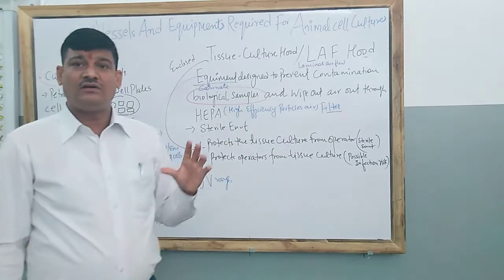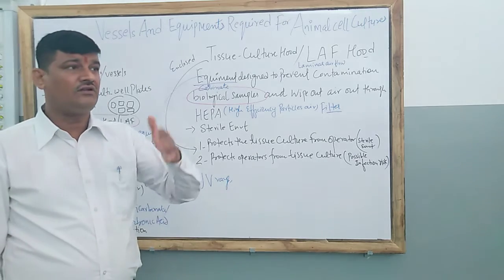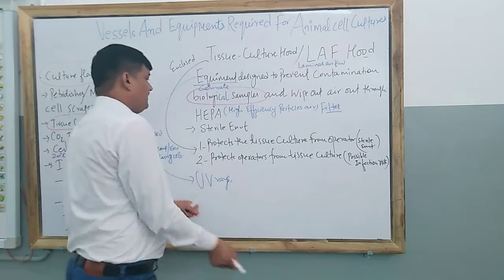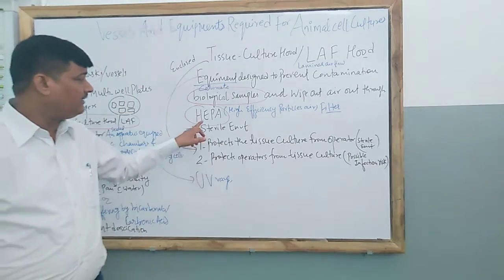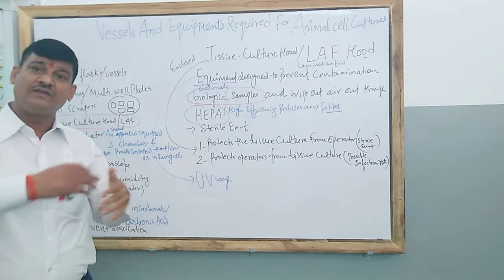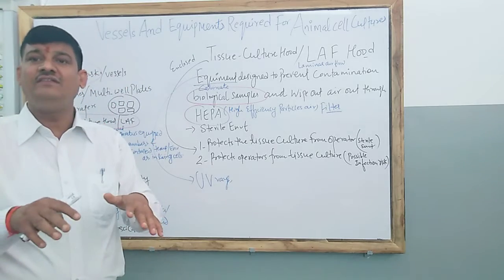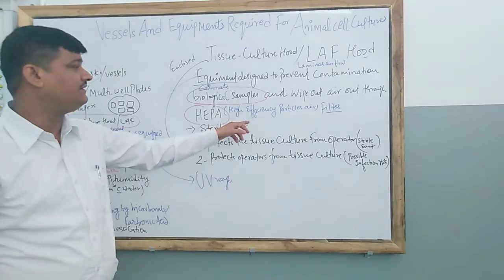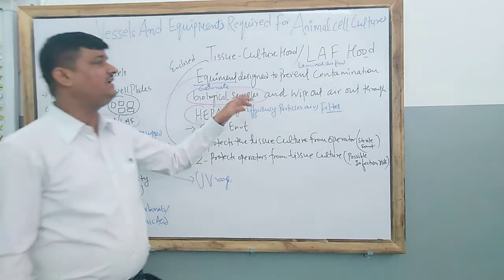The air filtered in the tissue culture hood is not a normal one. It is not like a normal particle filter or air filter; its name is HEPA. What is the meaning of HEPA? It stands for high efficiency particulate air. HEPA is fitted in the tissue culture hood, and its main function is to continuously push the foul air inside the cabinet outside, with the help of the high efficiency particle filter installed inside the cabinet hood.